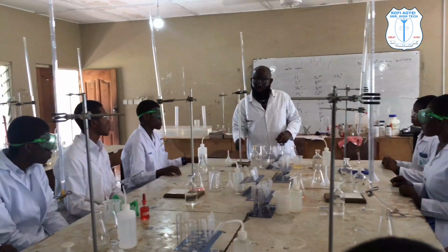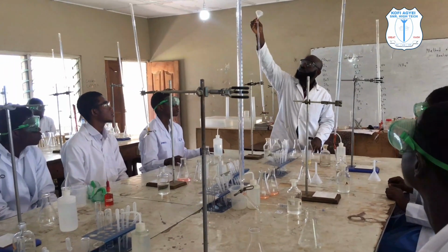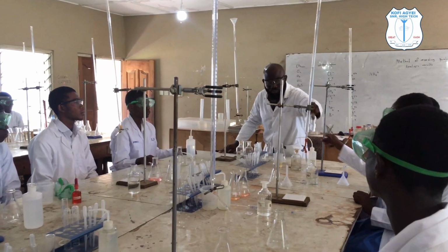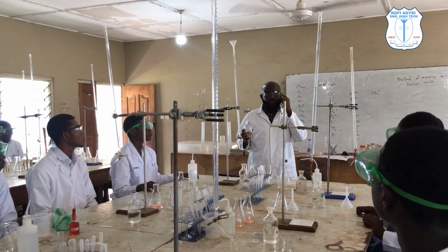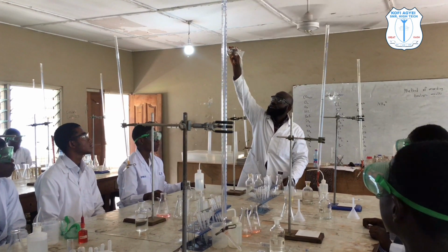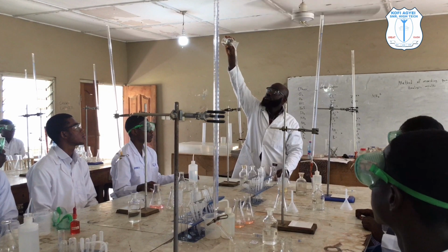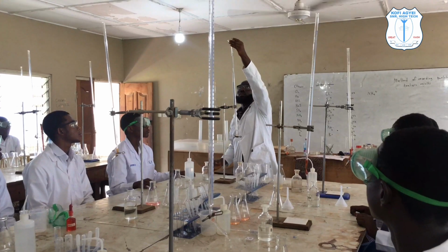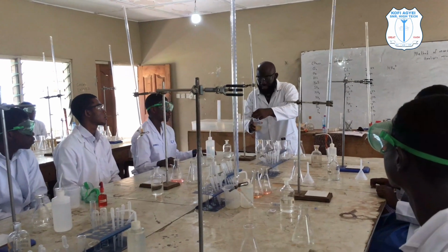Now with simple titration, you are going to pour the acid gently into the burette with the help of what? A funnel. Now since this one is an acid, it is always advisable for you to wear what? Goggles. Understood? Then you pour gently. So you are going to adjust it to the 0 mark.